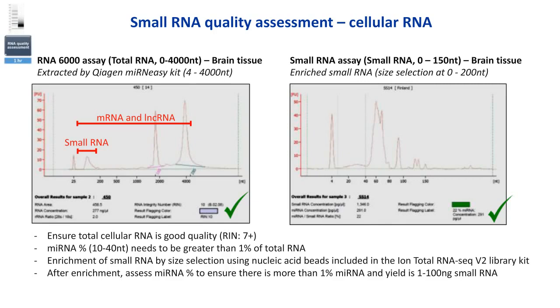When you then look at the small RNA profile, you can see peaks of tRNA and ribosomal RNA. With these sorts of samples, what I do with the small RNA assay is determine the percentage of microRNA. This percentage will give you an indication of how successful your small RNA libraries will be. This particular sample is 22% after enrichment. Even if the small RNA percentage is quite low, I believe it is necessary to perform a small RNA enrichment before continuing on to small RNA library construction, as ideally you want to remove as much messenger RNA out of the system as possible before attaching your adapters.